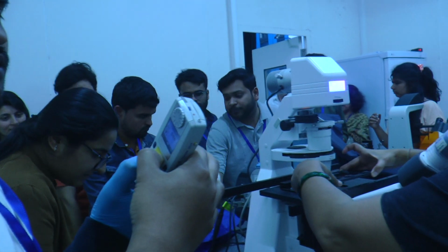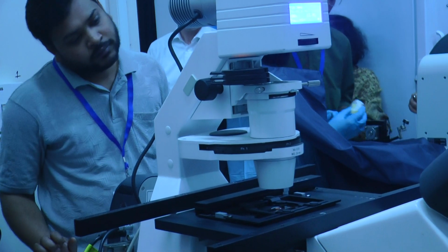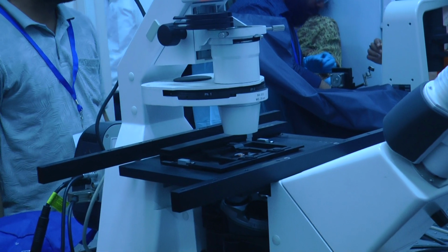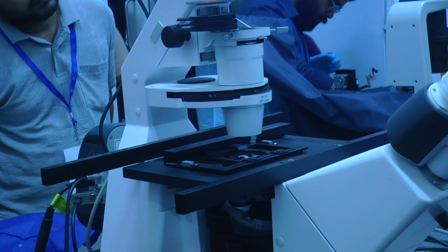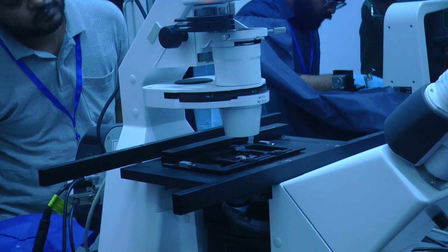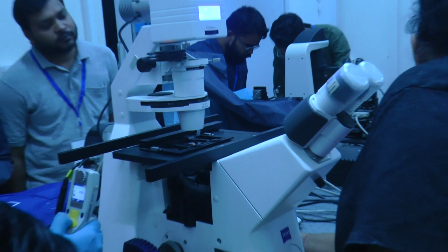It's your sample. What's the salinity? 0.9. No, I have to press this one. Now inside. While it is releasing, no, not the bubble. It's going. Okay. Fully. No release without bubble. You put a lot of water.